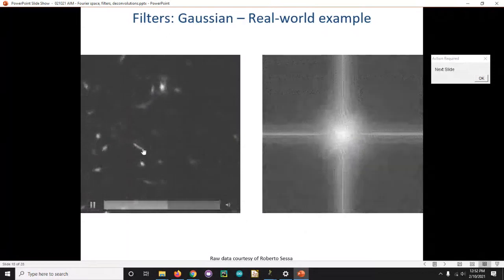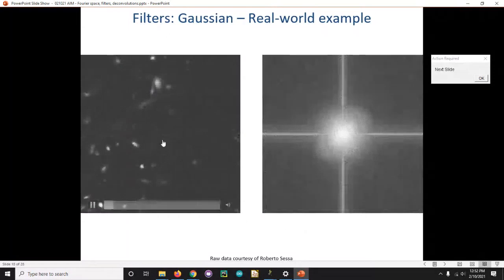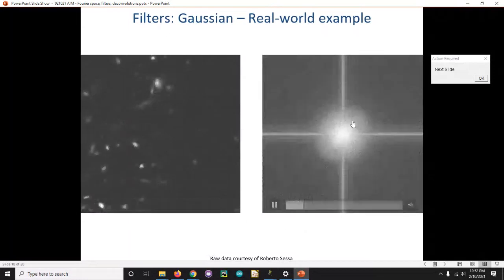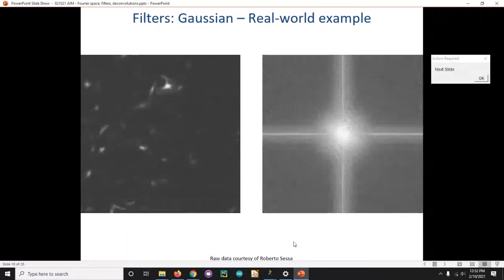Now we've blurred that exact same movie, and if you look at our Fourier transform, we can see the resolution stays constant. Notice the information content of the image is constant. You might say the image doesn't look that good. Well, it's nice for us for it to look good, but for a computer to find objects or come up with a mathematical definition of some feature, it's best to keep it consistent so that whatever definition you come up with is the same in every frame.